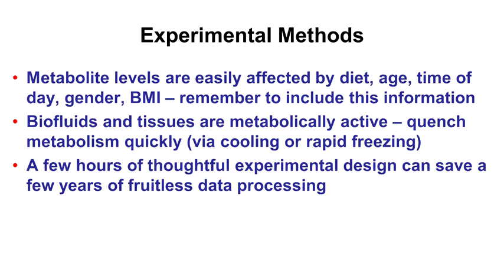It also means working with samples relatively quickly. Leaving things out for several hours on the bench is bad. Working in a cold room is a good idea if you can.